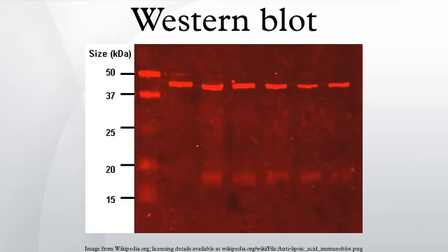In principle, this method allows for the separation of all cellular proteins on a single large gel. A major advantage of this method is that it often distinguishes between different isoforms of a particular protein, for example a protein that has been phosphorylated. Proteins that have been separated can be cut out of the gel and then analyzed by mass spectrometry, which identifies the protein. Please refer to reference articles for examples of the application of 2D SDS-PAGE.